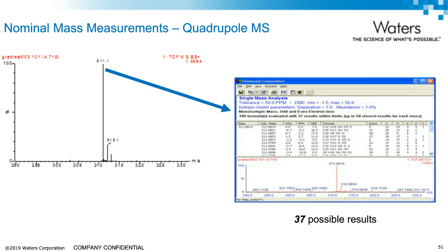that data alone. Modern quadrupole MS systems are capable of running both MS and MS-MS experiments during the same run, so we may be able to obtain more information from this type of scan. However, the mass accuracy would not be improved.